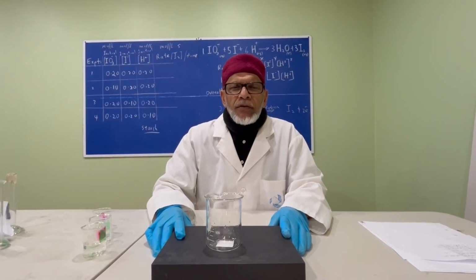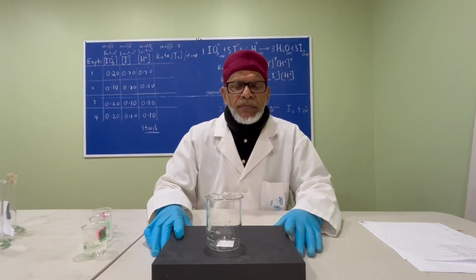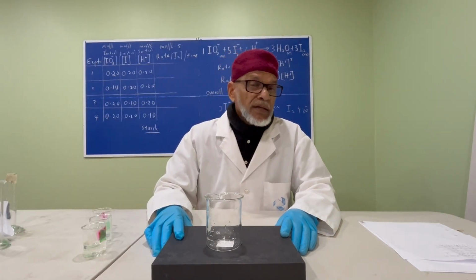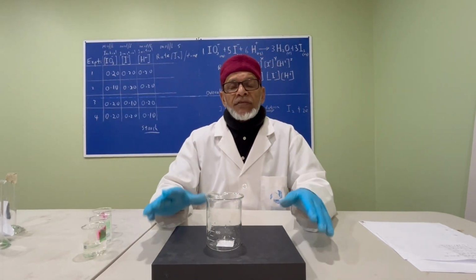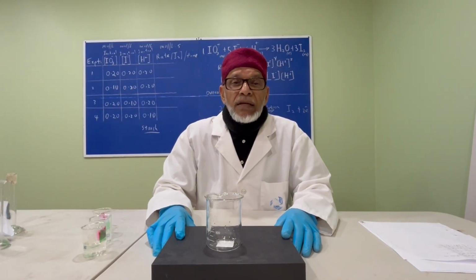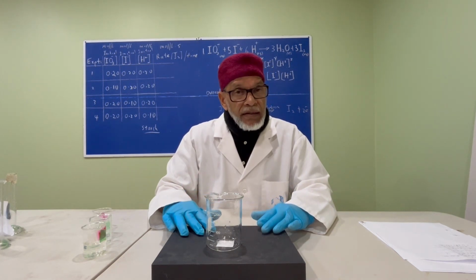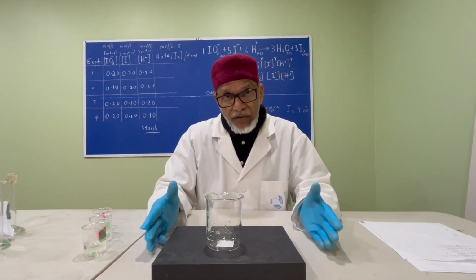This reaction follows a similar trend as what happened between sodium thiosulphate and hydrochloric acid. Recall that the moment we mixed the sodium thiosulphate solution with hydrochloric acid, a precipitate of sulfur started to form. In this case, the same thing is going to happen with iodine. The moment you mix these together, iodine begins to form.